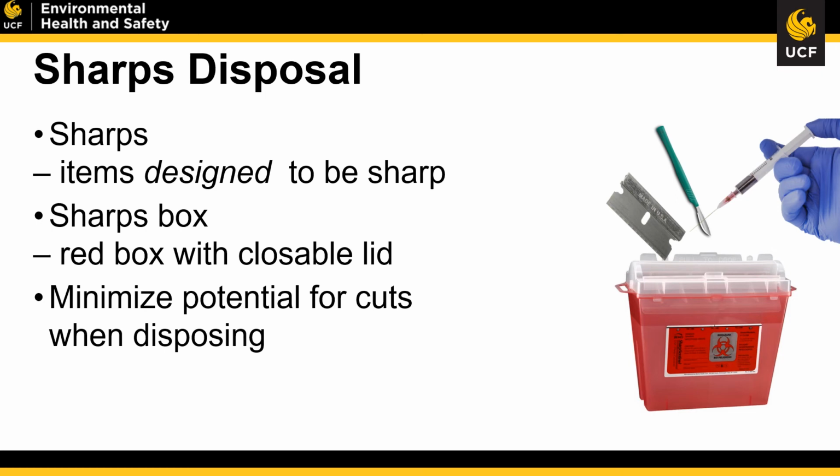Make sure that when you remove the sharps, you're doing so in a fashion that minimizes your risk from the bladed edge or the needle side. Make sure that when you put them in the container, they go in and they do not come back out. Do not remove sharps from a container, and don't overfill the container. Once that container gets reasonably filled, close the lid and dispose of it appropriately.